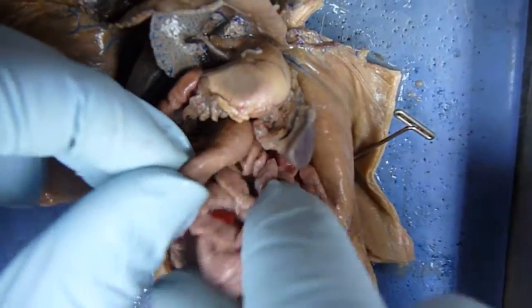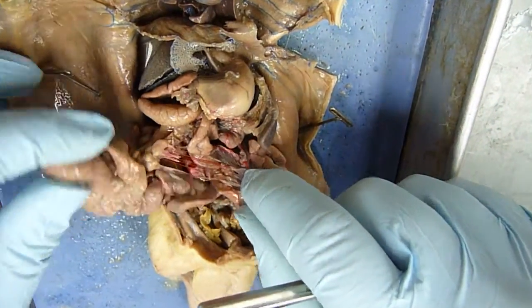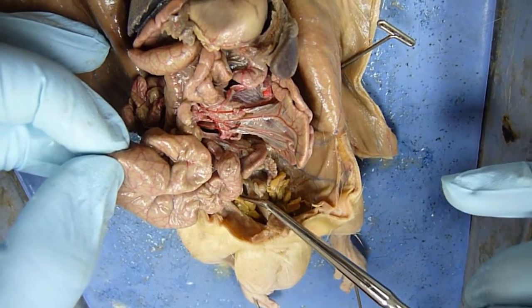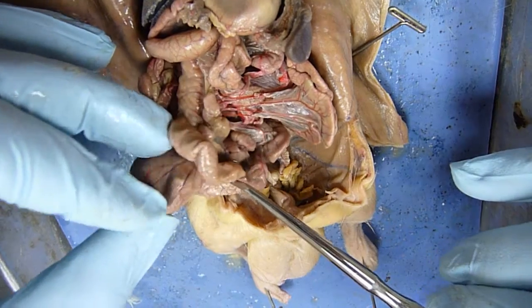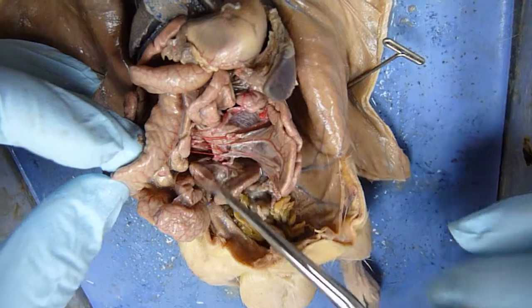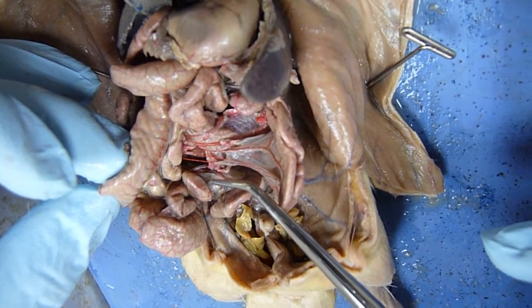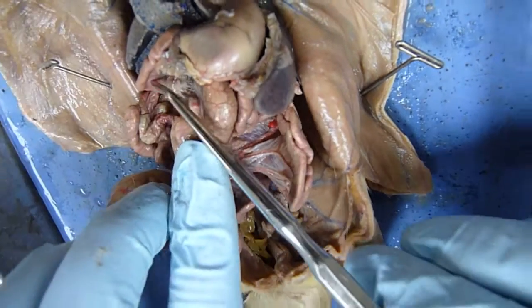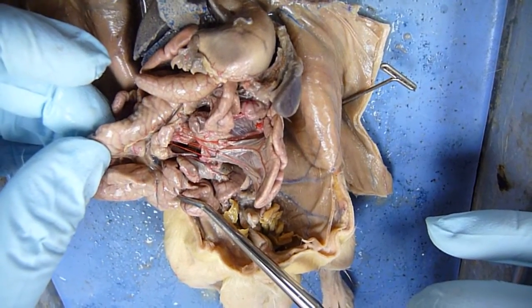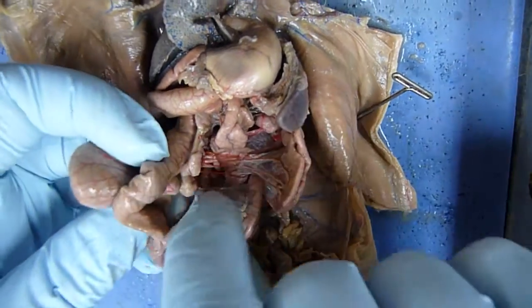Then as we follow the digestive tract, we get to this big pouch, which looks like a second stomach. This is called the cecum. The small intestines that are leading into the cecum are called the jejunal-ileum. Okay? And the only way we can really differentiate the jejunal-ileum from our duodenum is basically proximity to either the stomach or the cecum. And then leading out of the cecum is where the large intestines start.